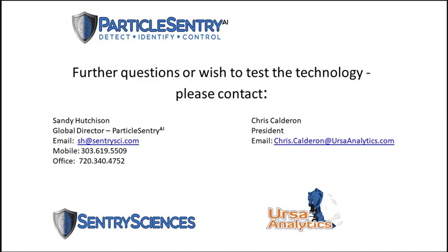You need to have the same resolution, whatever you're doing, whenever you're comparing these types of tools that we're looking at. You just need to make sure that you have the same exact image type and compression scheme used consistently throughout. It doesn't really matter what the format is. It's just a pre-processing step to pull it out. But you can't start mixing and matching.